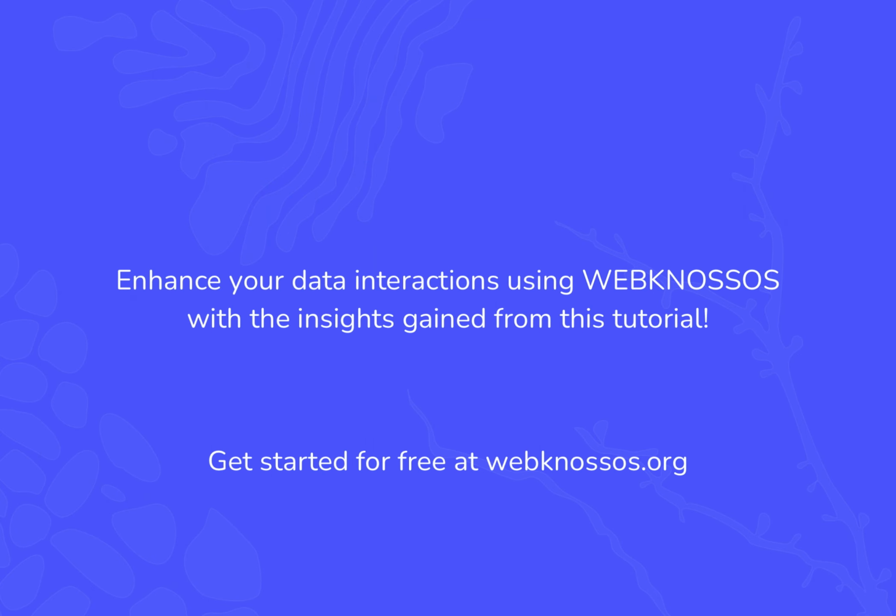Enhance your data interactions using WEBKNOSSOS with the insights gained from this tutorial.